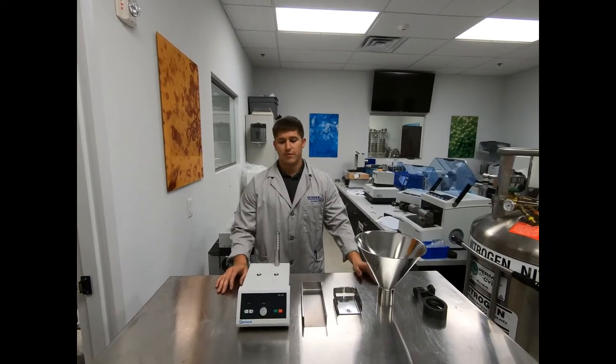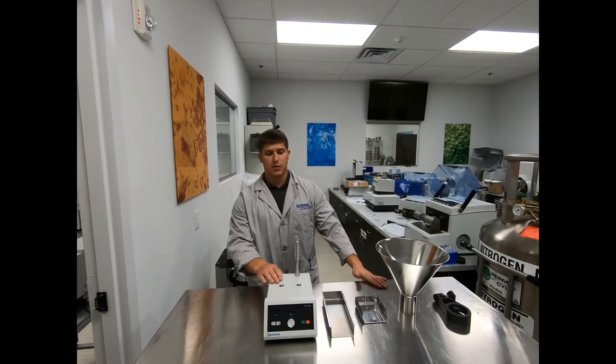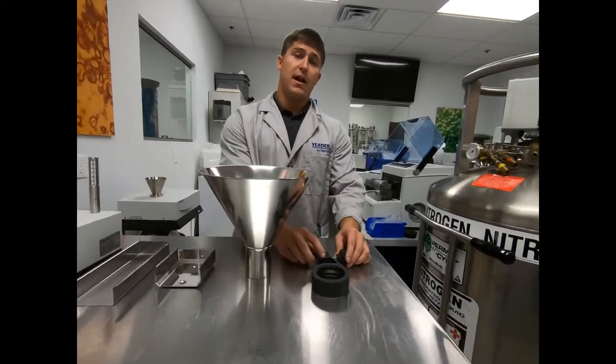The DR100 vibratory feeder for your PT200 sample divider comes fully equipped with the drive unit itself, the push feed chute and holder, along with the hopper and fixture.